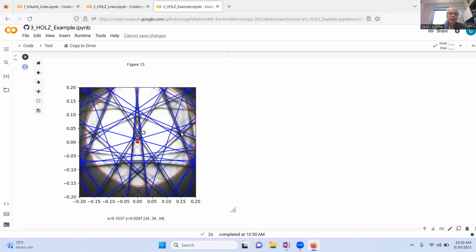If we look at this angle, it changed. So there's a new one. So, okay, we have a shift in the angle here, of the crossover here. We have a shift here.